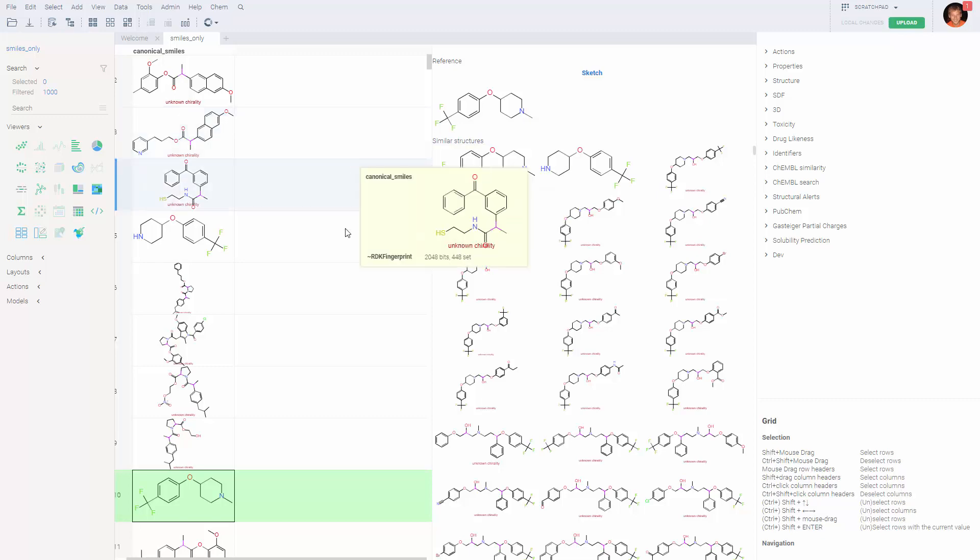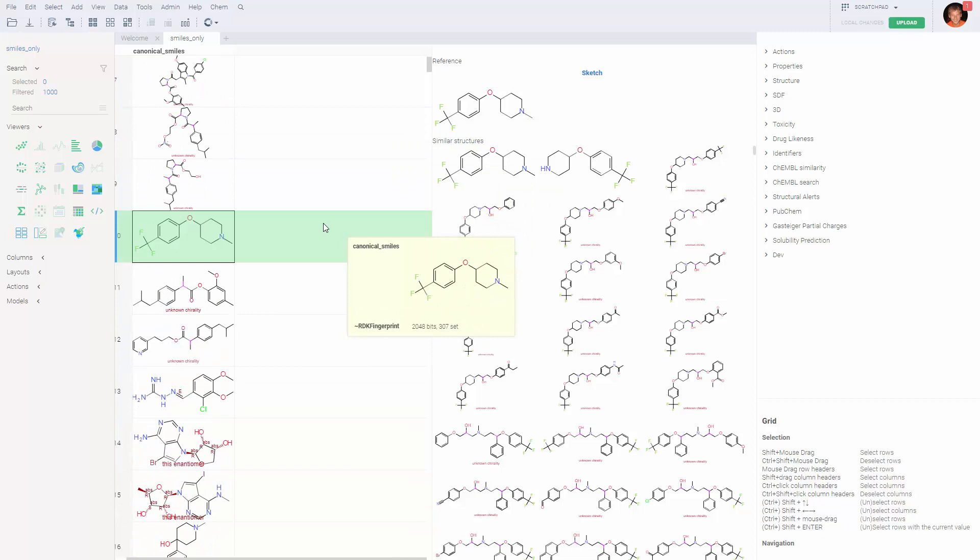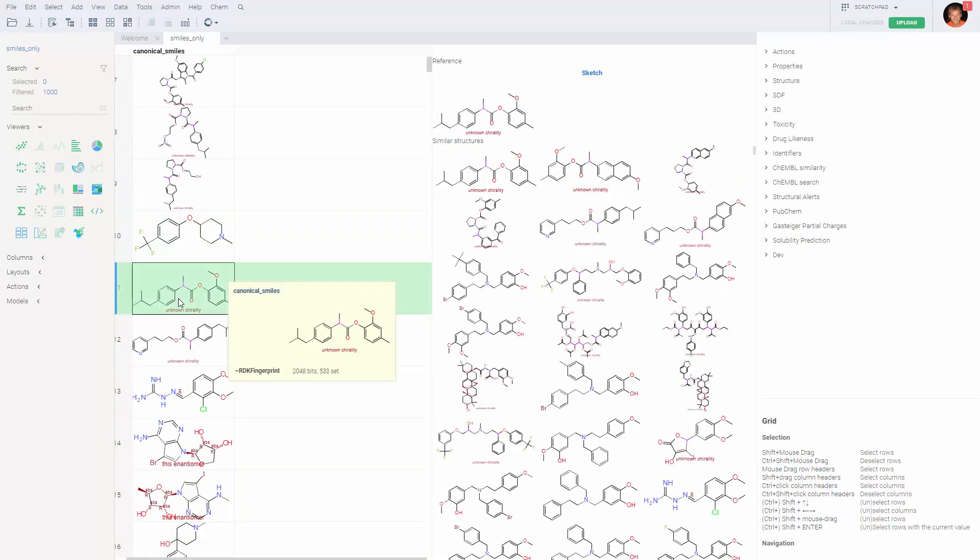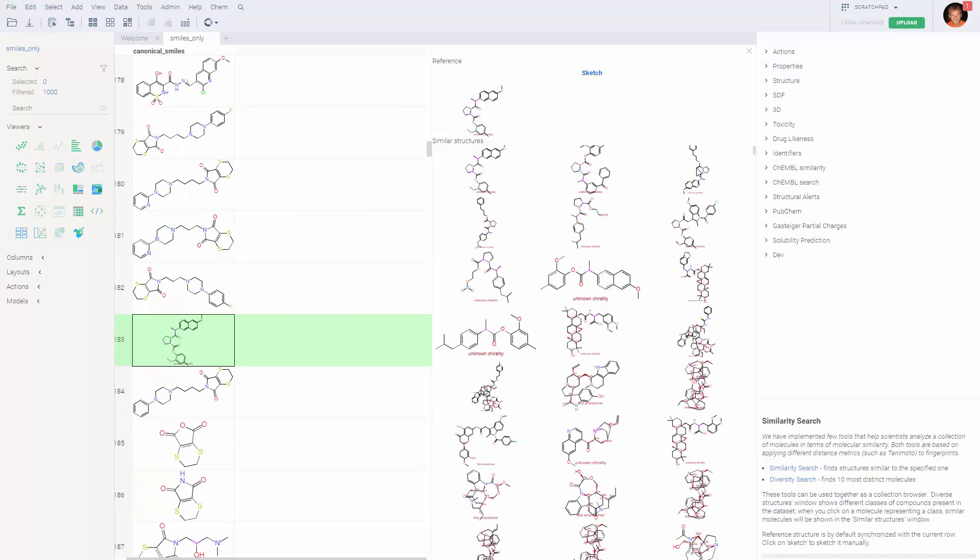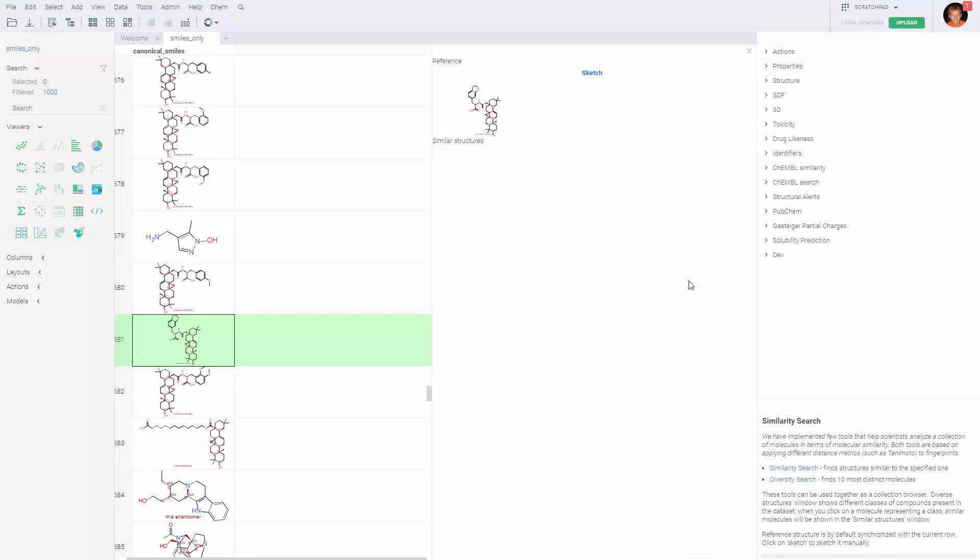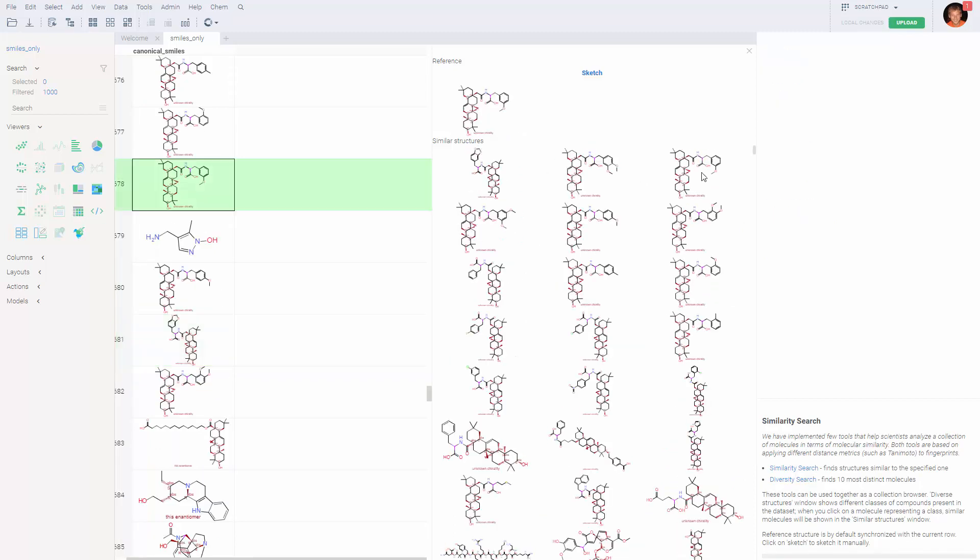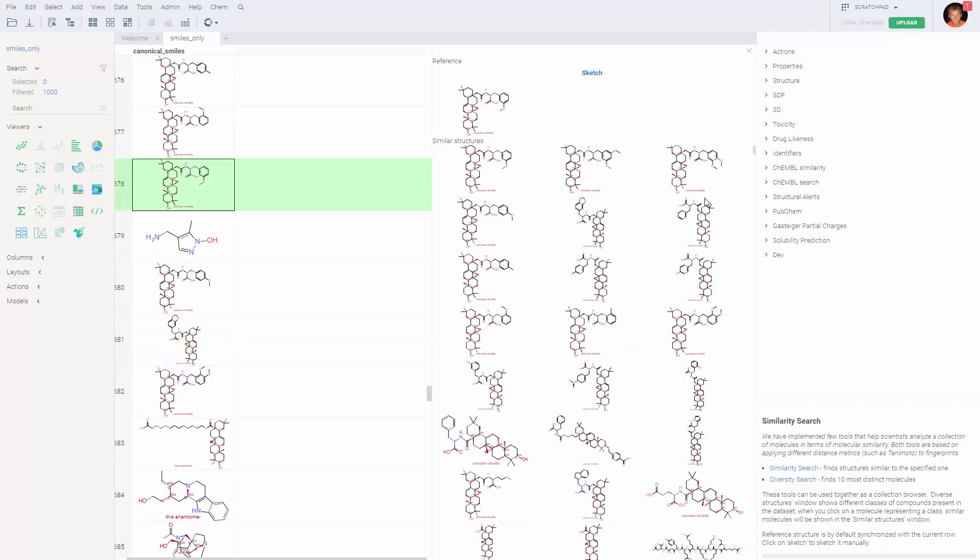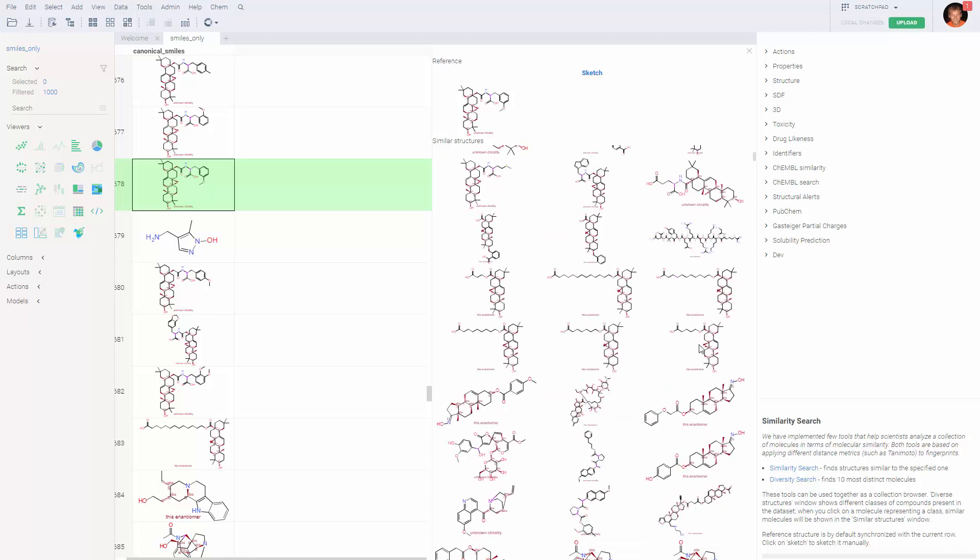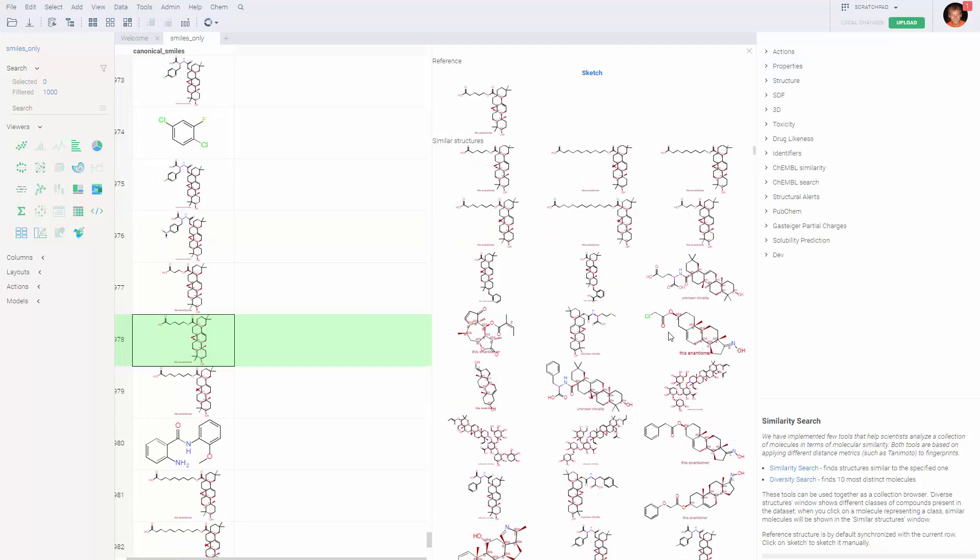Everything is customizable, but we will not go that deep in this video. An alternative way to change the reference molecule would be to click on the molecule in that list, which allows us to sort of drill down in our dataset and find different classes of molecules.